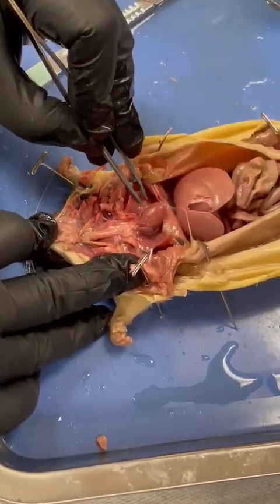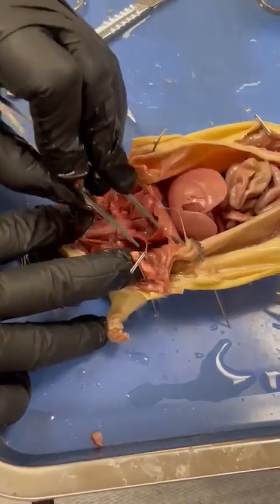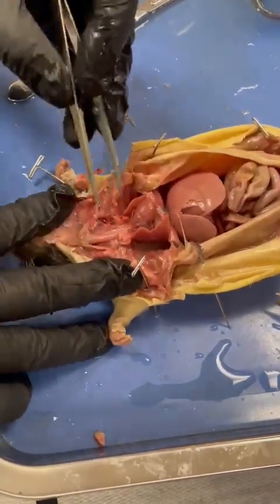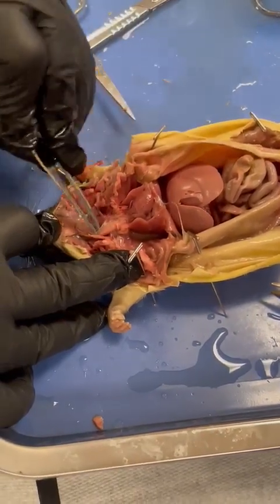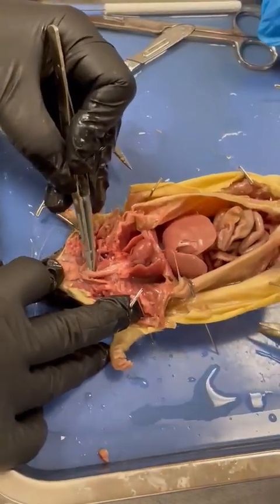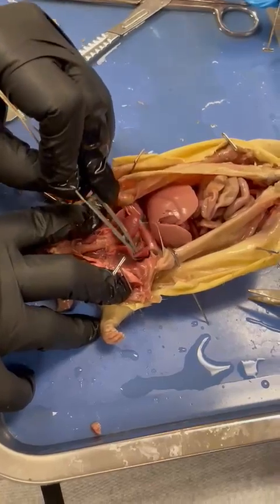There's the left lung, two lobes. Right lung, three lobes. Thoracic cavity, the ribs. Below the trachea is the esophagus. It's much thinner, so you can look at it yourselves. So left lung, right lung.